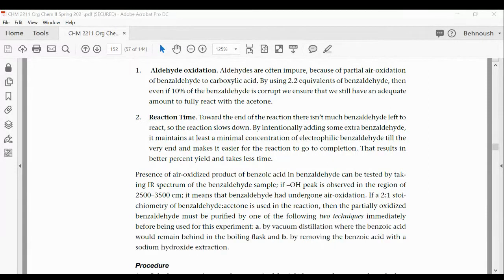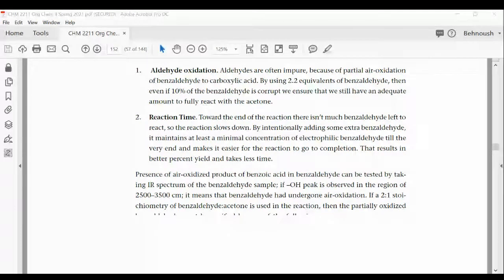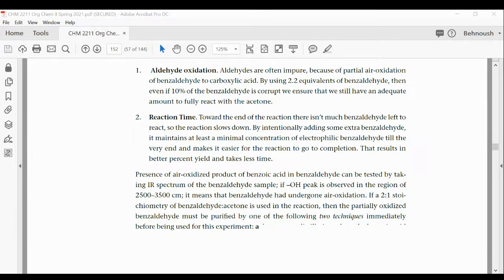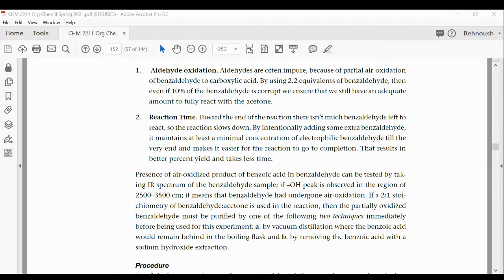Okay, so it was just at the end, whether the product was pure or impure. The melting point, we talked about when it's lower than the literature value, that would mean that there are impurities, right? Yes. But then when we looked at the IR, it showed the disappearance of the C=O double bond and the appearance of the OH bond. Okay, very good. That shows purity, right? That is a good observation. How far off was the melting point from the literature value? Maybe like 1 or 2 degrees? Let me look, because I was trying to make sense of this at the end.